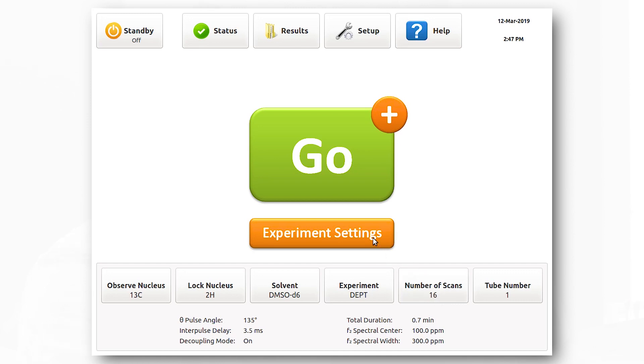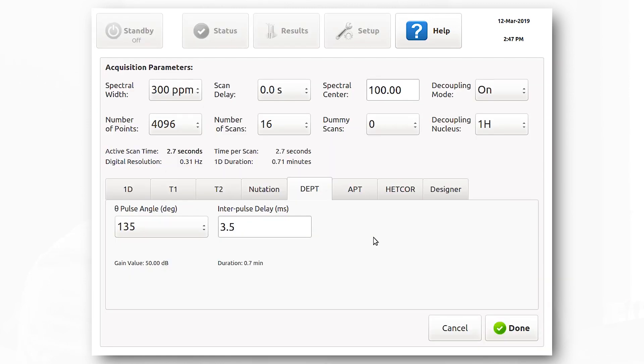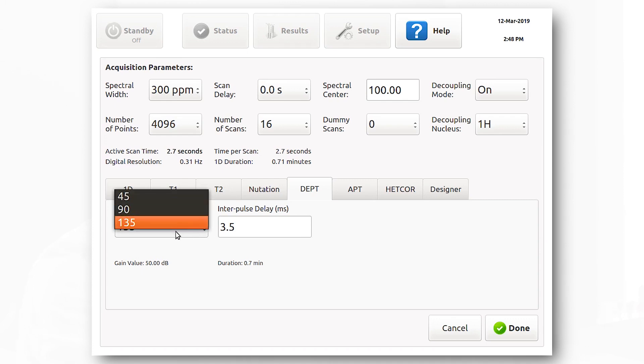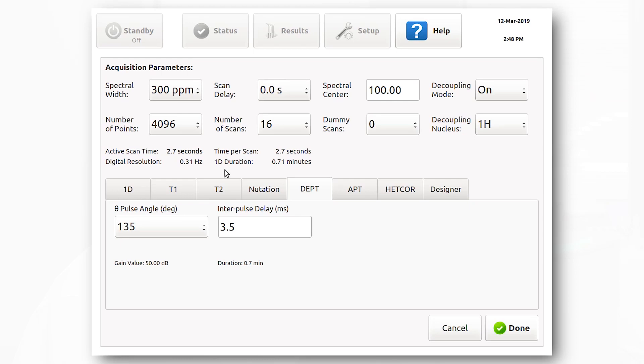Another thing that we can change is we can reduce the number of scans due to increased sensitivity. After we change the experiment to DEPT, we can go to the experiments tab in the settings menu and choose the type of DEPT experiment we want to run. We can choose DEPT 45, DEPT 90, or DEPT 135. In this experiment, we'll be running DEPT 135. The duration of this experiment will be 0.71 minutes.